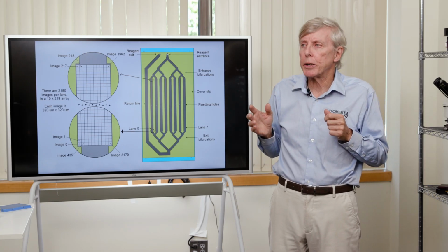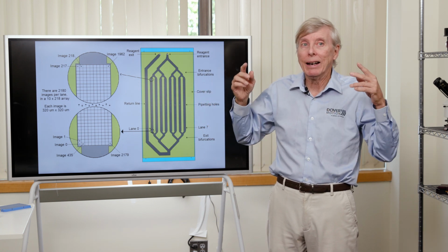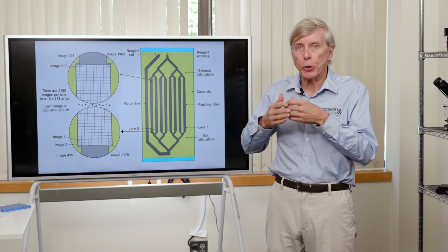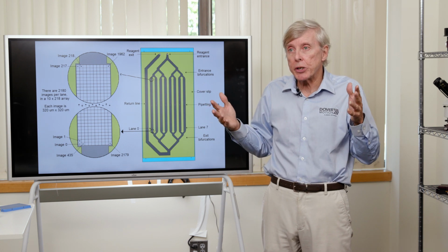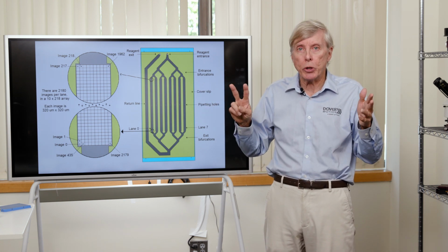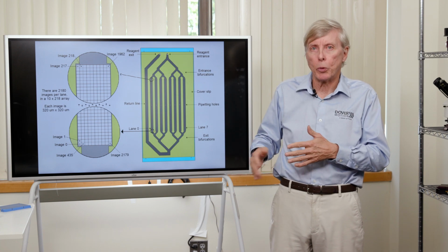So basically what this sequential field motion amounts to is get me to the field of view on time, and the idea is to get from each one as quickly as possible. And you can also describe what needs to happen as 2 key attributes: move really fast and then hold really still. If we're not holding really still, and we're talking at the 100 nanometer or below level, then these microscopy images are going to be blurry, and that is unacceptable to get the data that's required. So it's move real fast, hold real still, rinse and repeat.